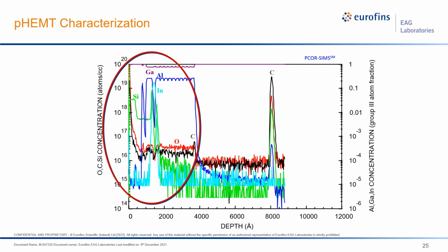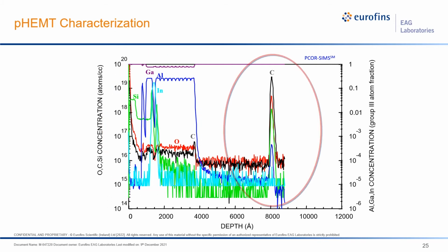So first, we want to look at the epitaxy substrate interface impurity analyses. Please note that this is essentially 1 or 2 monolayers of an impurity at the start of an epitaxial growth. So if you really want to do a reliable measurement of these impurities, you have to prove that the SIMS had the ability to measure these with a certain precision so you can make comparisons. So as I've shown before, the way we do that is making a measurement in close proximity of each other in a given sample to determine a statistical deviation.